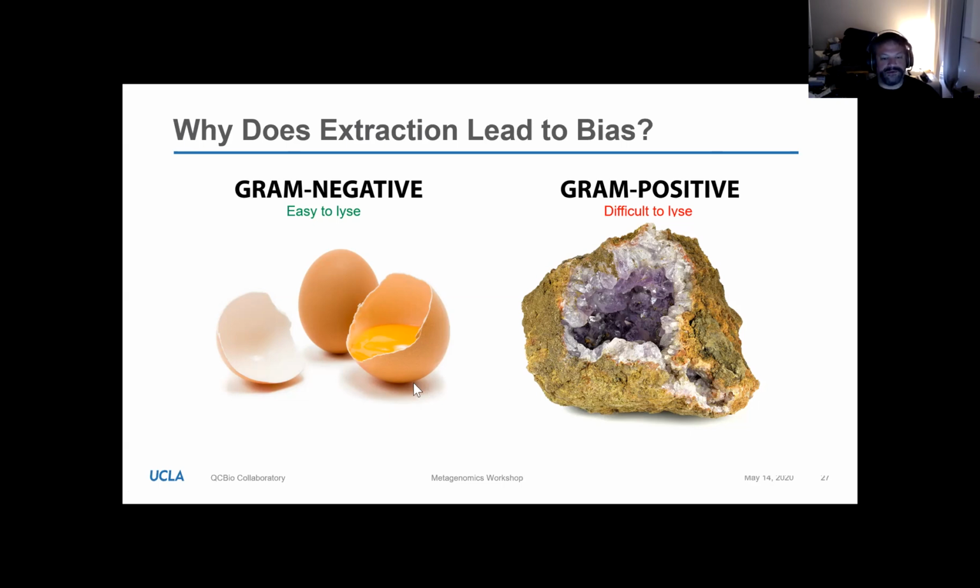And this is something that's important to know, because, for example, if I had a super simple microbiome where it was 50% E. coli, 50% Listeria, and I just put the sample into boil for about 10 minutes, that's going to lyse all the E. coli, because E. coli tend to fall apart easily, especially under heat conditions. The Listeria are all going to be dead, so nothing's going to be culturable after 10 minutes of boiling.